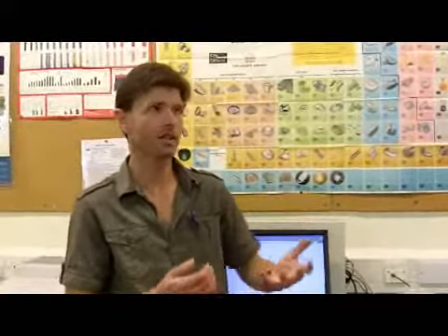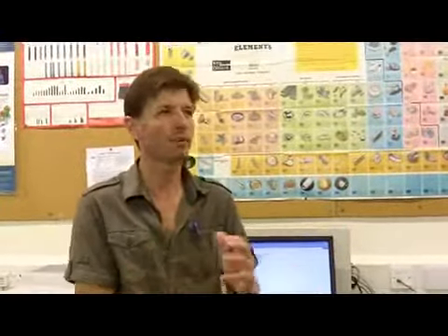Okay, so X-ray photoelectron spectroscopy, we fire X-rays at a surface, the X-rays ionise the atoms that are at the surface, the electrons that are produced come out, we measure their kinetic energy, and that kinetic energy combined with the photon energy tells us about how strongly they were held in the atom on the surface. It's sort of the ionisation energy, and as you know, the ionisation energy is a fingerprint of the element. So by measuring the binding energy, is what we call it, we can determine what elements are present on the surface. It's surface sensitive because the electrons can only travel a short distance through the solid.